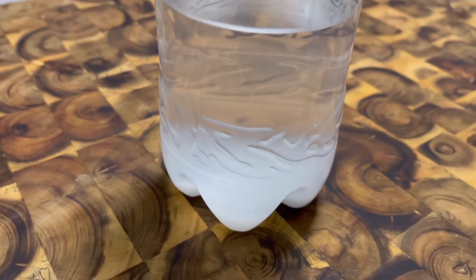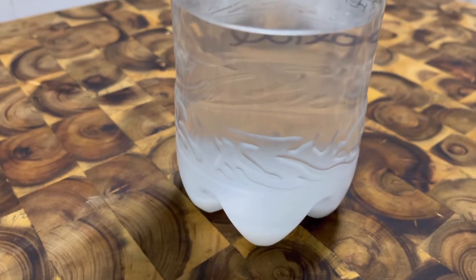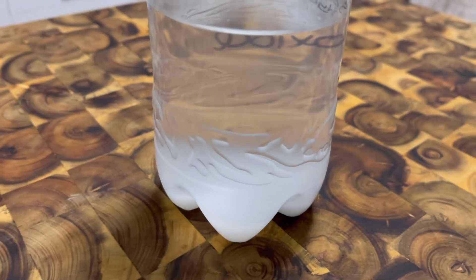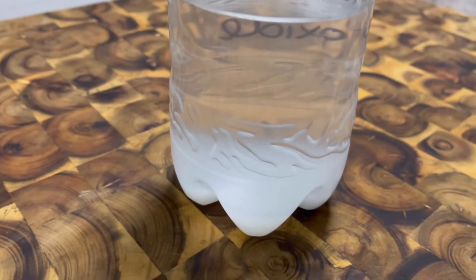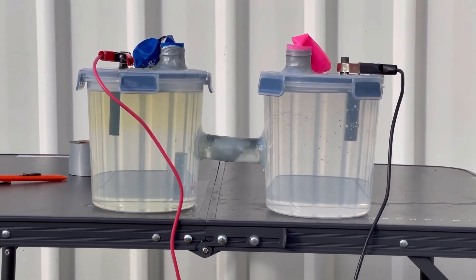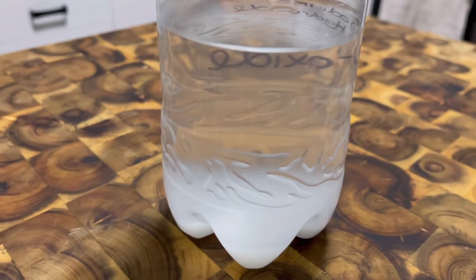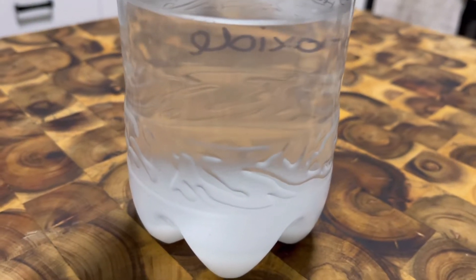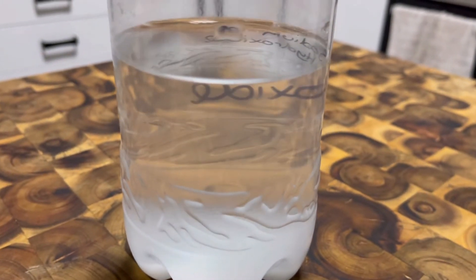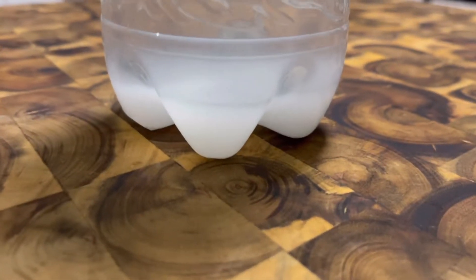Hi all, I hope all is well. I just wanted to do a quick update on my sodium hydroxide production. As you can see in my previous video, I used electrolysis to process seawater to extract chlorine and sodium hydroxide and maybe natrium. However, we're uncertain as to whether it's sodium hydroxide or if it's natrium. The best way to test that is to test some of the clear liquid and also some of the cloudy liquid.